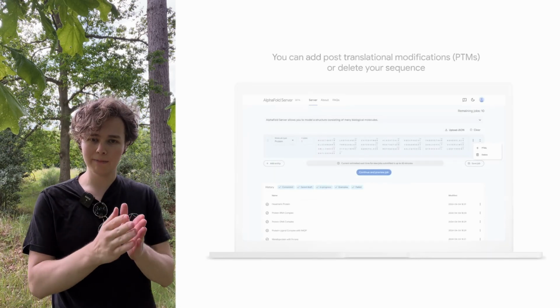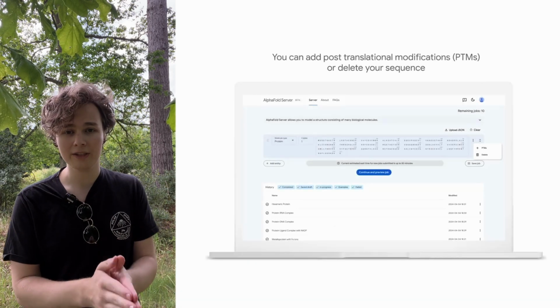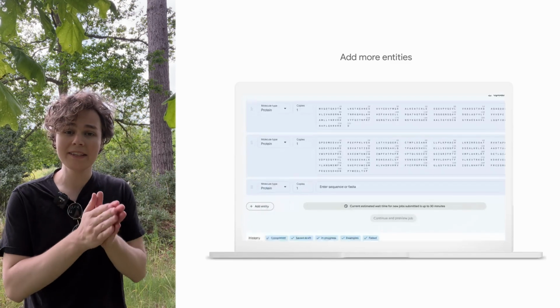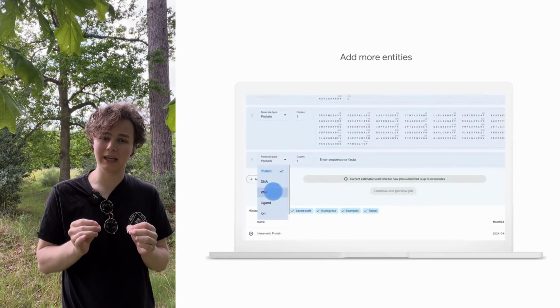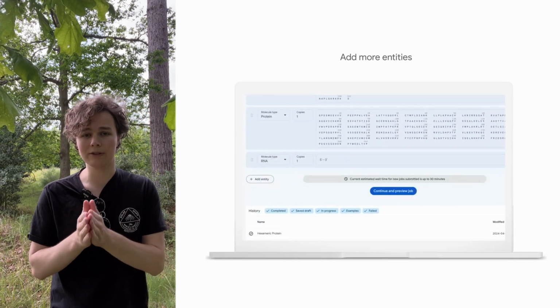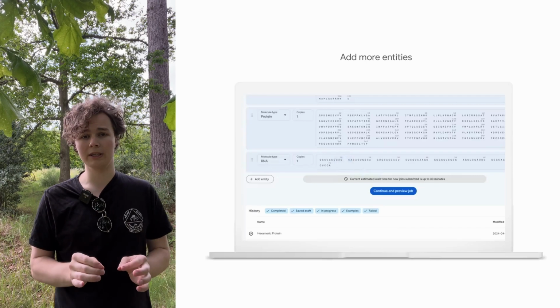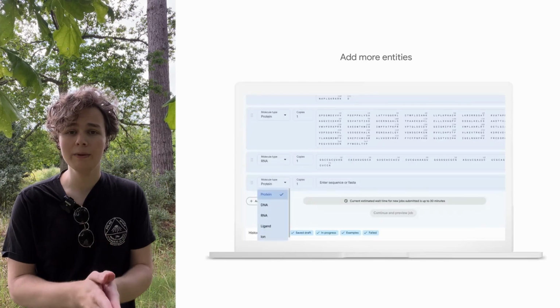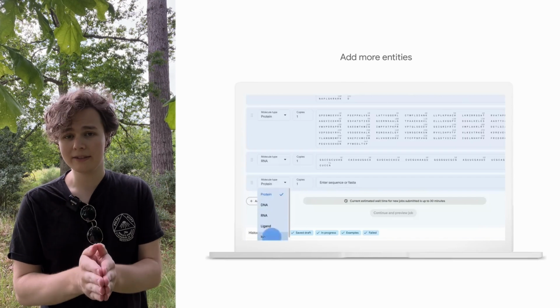Okay, so what is AlphaFold3 then compared to AlphaFold2? So from my understanding, AlphaFold3 can now model post-translational modifications and interactions with certain small molecules, such as DNA. And this is important because post-translational modifications can massively affect a protein structure, and they're crucial for protein interactions, especially in eukaryotic biology. AlphaFold3 now accommodates these modifications, which were actually missed in AlphaFold2.